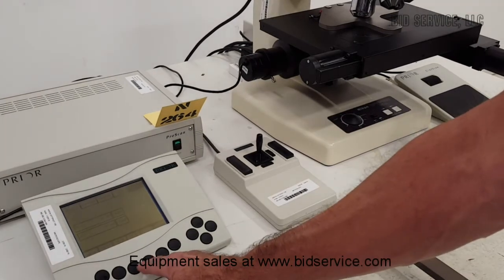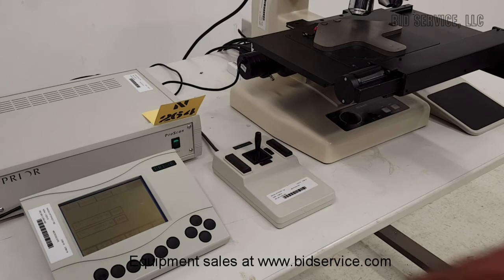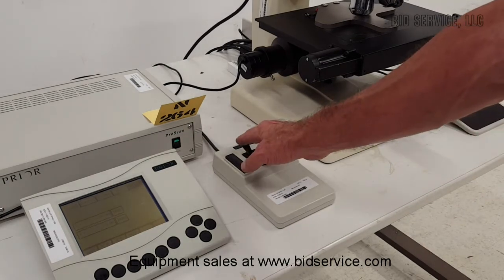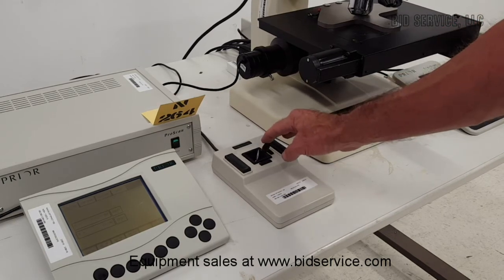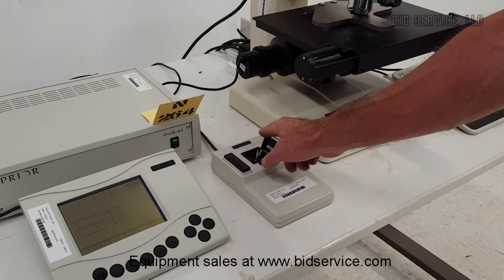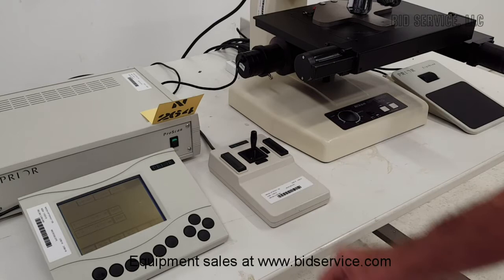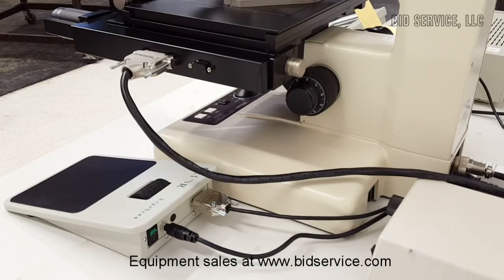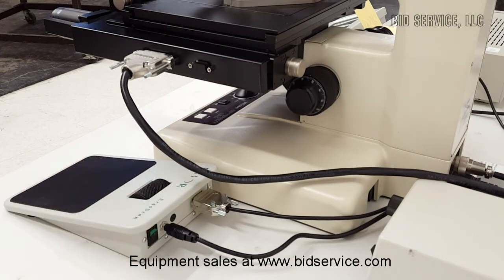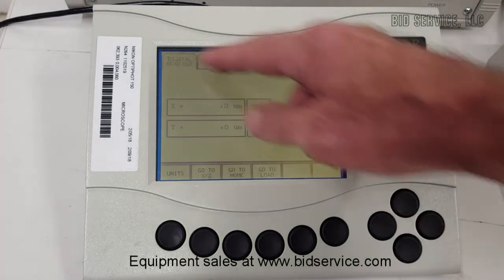Here on the controller, we'll push go to load. We'll go home. And the joystick. You can change the speed of the stage with this button. And here you can see the fine focus. Here you have the zero. Your X and Y. I have it on digital readout right now.